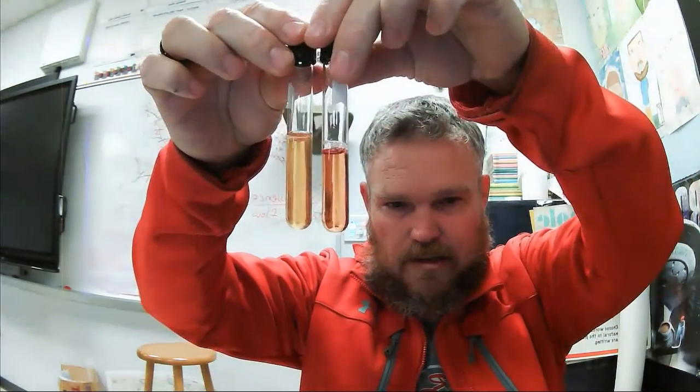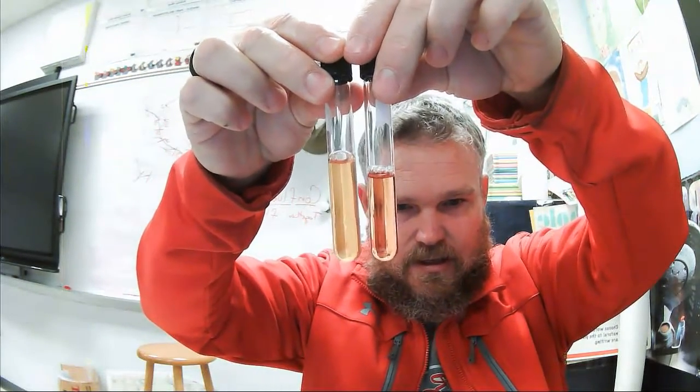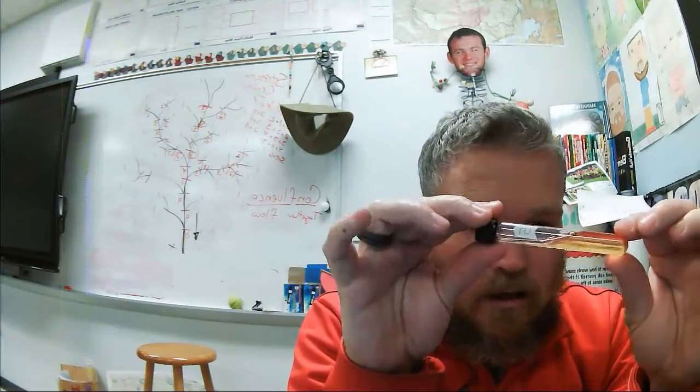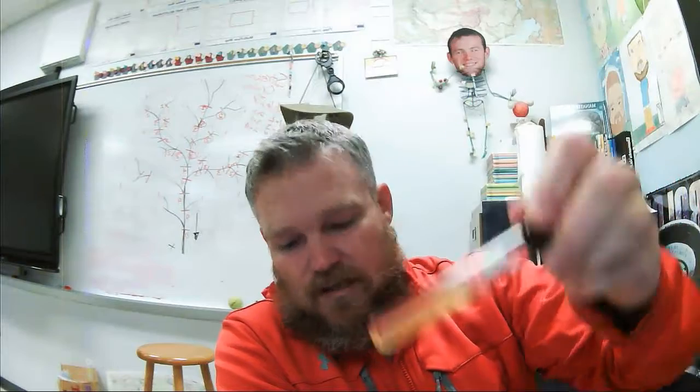Anyway, every once in a while what happens is this guy here and that guy, notice that there is a little bit of cloudiness, and it has a little bit of a yellow tone to it. This was a bottle dispensing filling station. Here on campus, if you haven't been here for a while, they've got a few bottle filler water fountains now, where a sensor fills your bottle, and this is what one of them came back as, which scared us a little bit, because you don't want to be drinking from that.